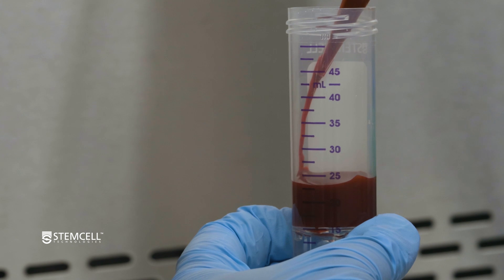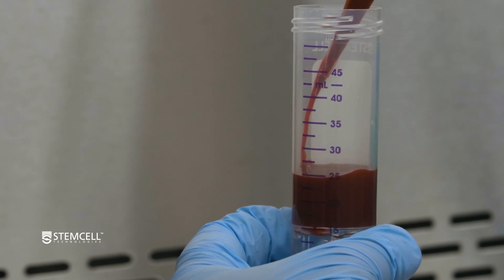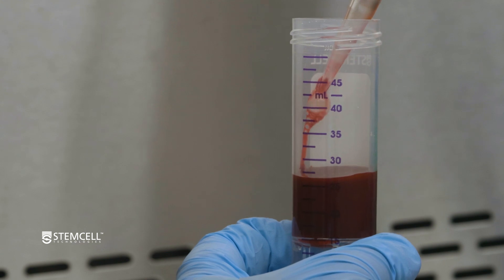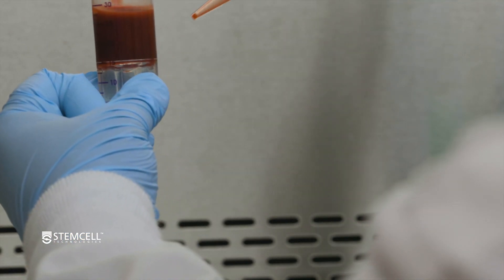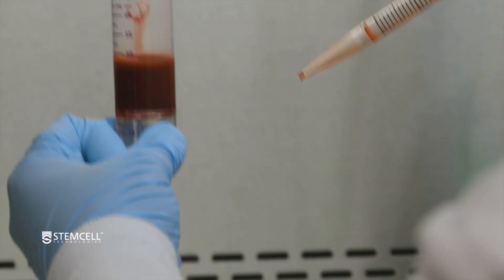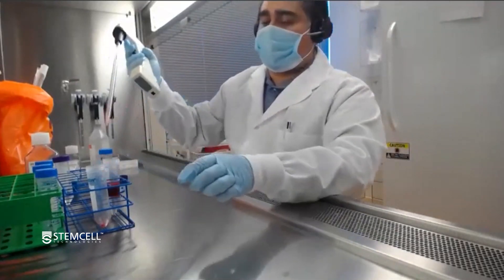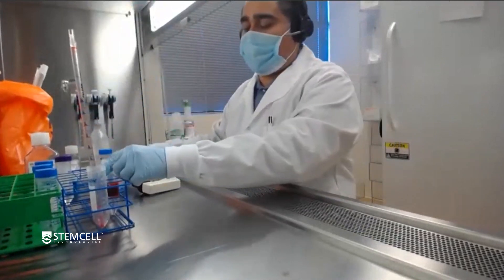A good tip when dispensing is to keep the tube vertical. This will help minimize how much blood mixes with the density layer underneath. Be aware that you will get a little bit of whole blood going just slightly underneath the insert, but this is perfectly normal. Now that it's dispensed, all you have to do is cap the tube and do a density centrifugation.